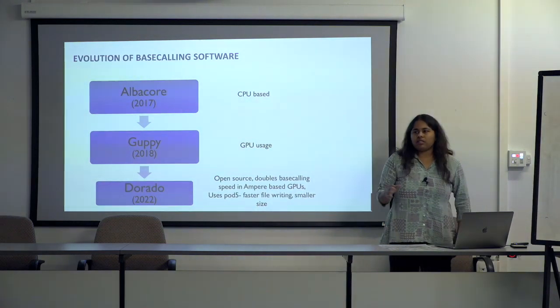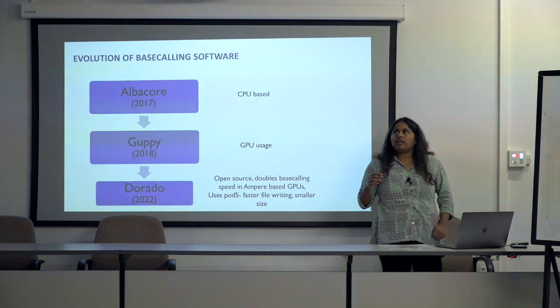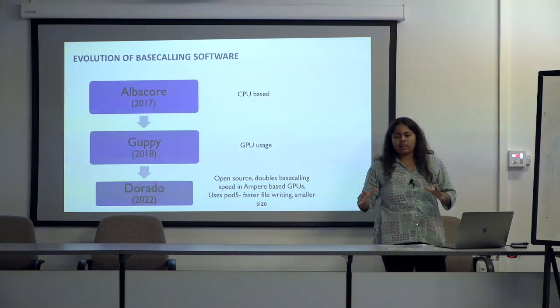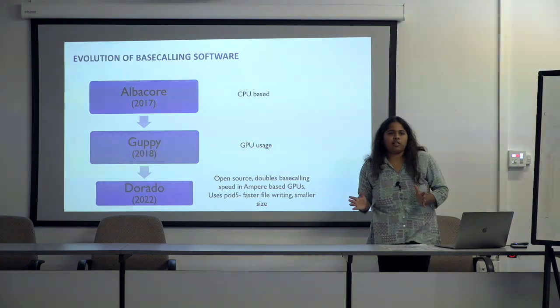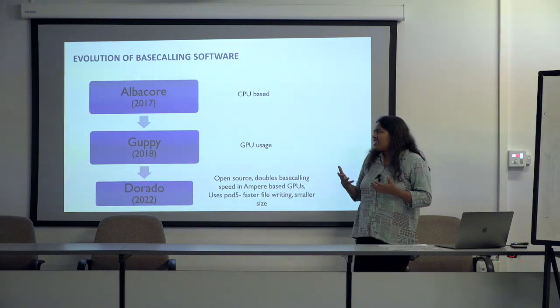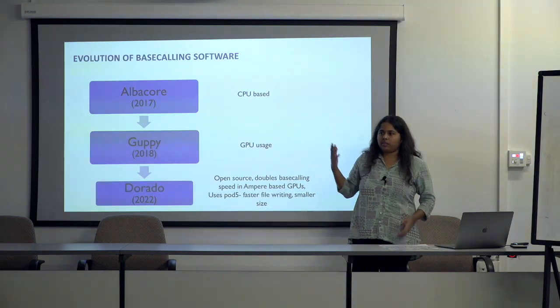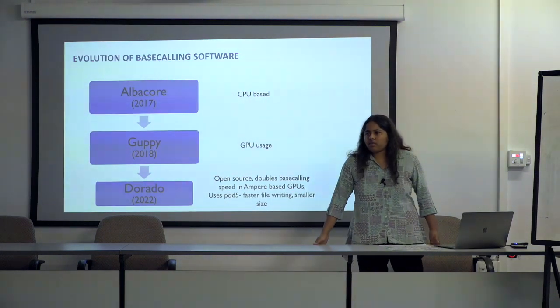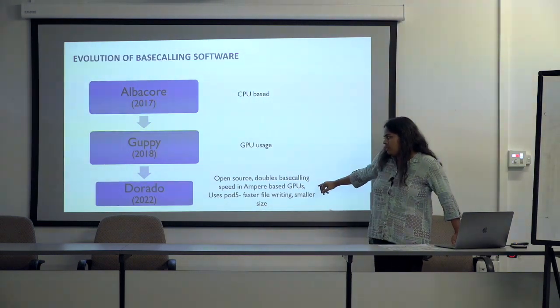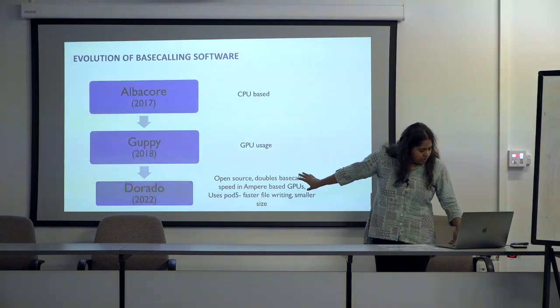One of the challenges with ONT data is that it's huge. A full MinION run can take up something like 200 to 300 GB per run. So if you are routinely sequencing, something like once a week, you get terabytes within a few months of usage. I think space reduction has been a major challenge when it comes to data handling, and I think they're moving towards that.